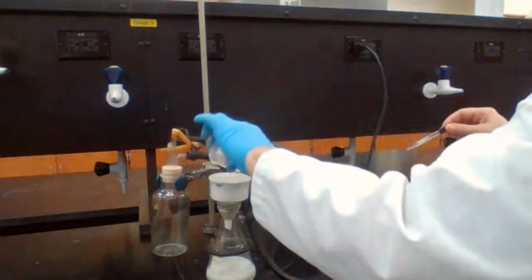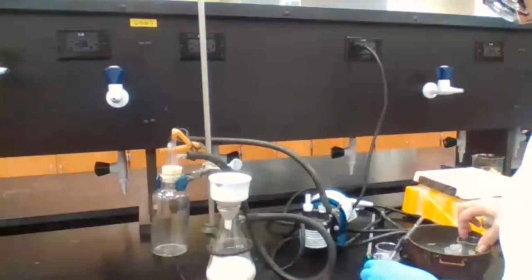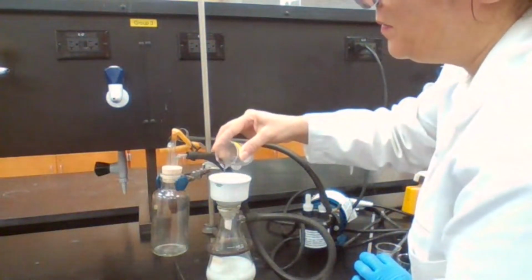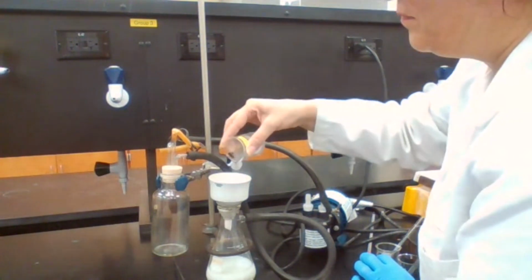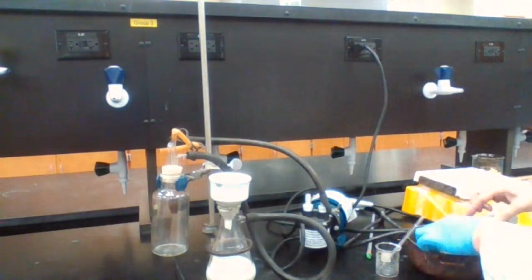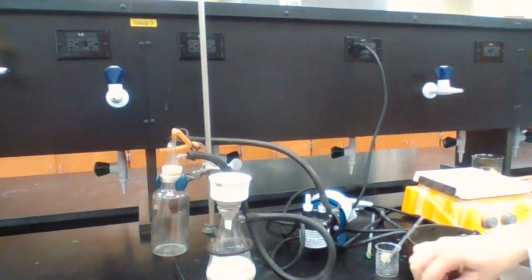Everything is transferred. And I'm going to wash it with cold methanol. Run vacuum for 5 minutes.